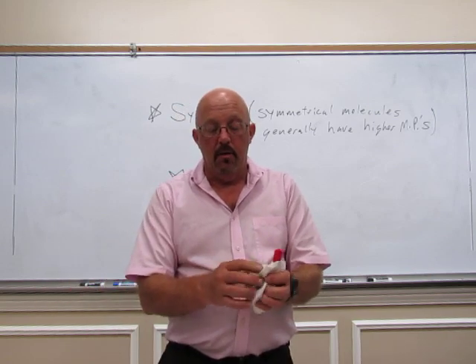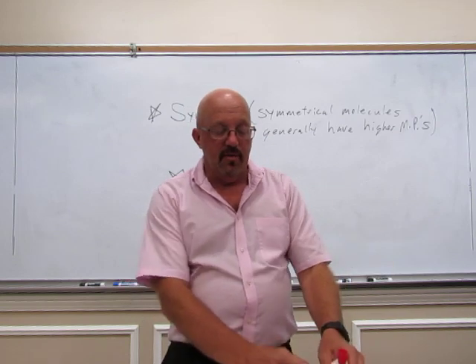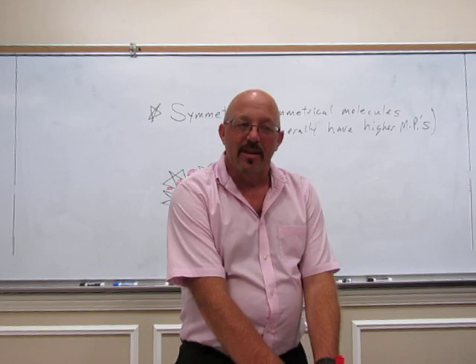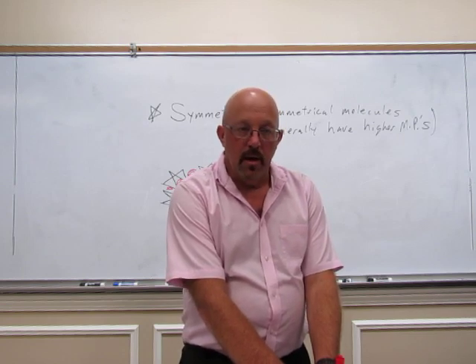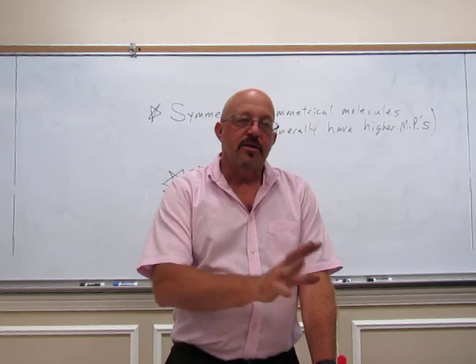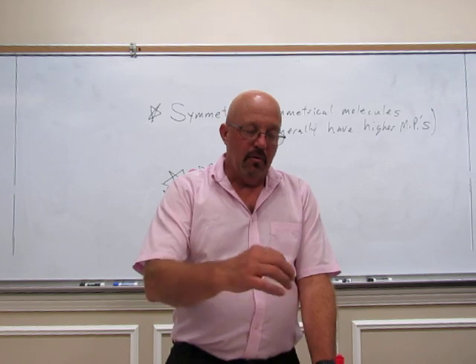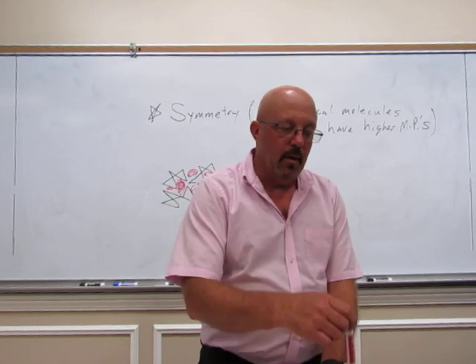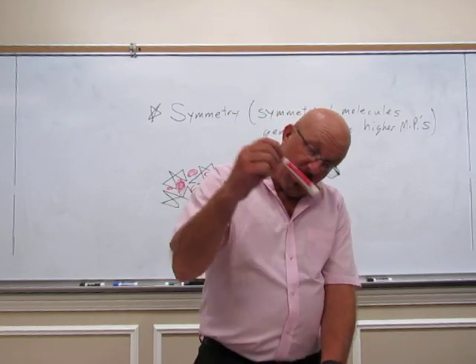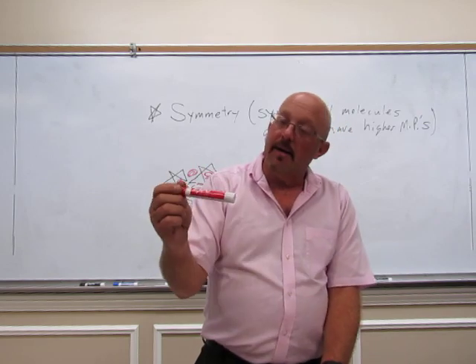Take the paper towel, wrap it around your reaction tube, and you can set that in a beaker. And just let it sit there and cool slowly. Don't touch it. You want to leave it undisturbed to cool slowly. And then you'll get the best crystals out that way. If you keep checking on it every now and then, you're shaking it essentially as you're pulling it in and out.